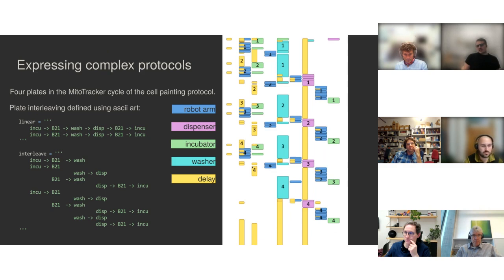So depending on these cycles, it can be different machines involved. The interleavings look slightly different depending on the machines in question. So just pick those that work best.